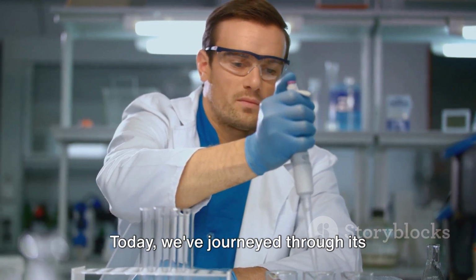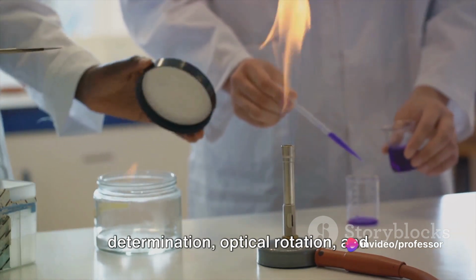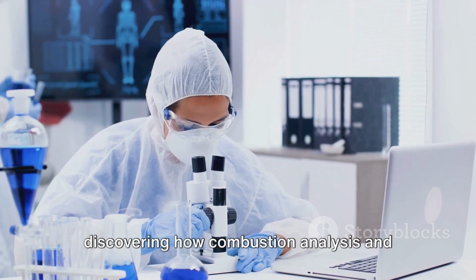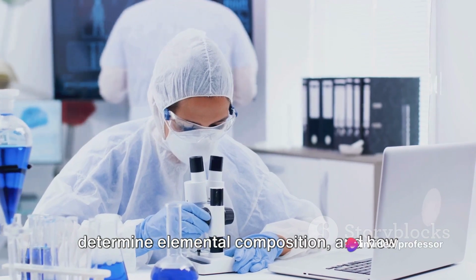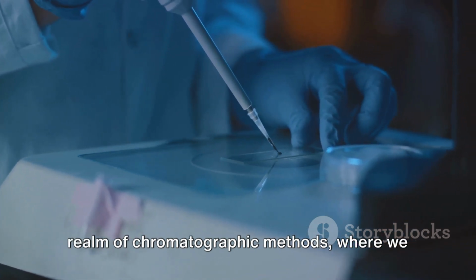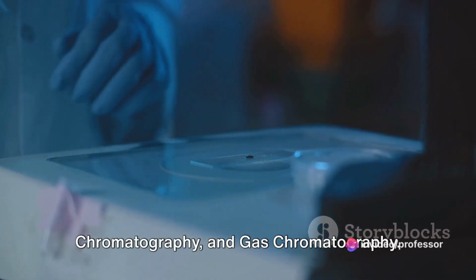Today, we've journeyed through its riveting landscape, exploring physical methods like melting and boiling point determination, optical rotation, and refractive index. We've delved into analytical methods, discovering how combustion analysis and high-resolution spectrometry help determine elemental composition and how relative molecular mass is established. Our expedition took us further into the realm of chromatographic methods, where we learned about thin-layer chromatography, high-performance thin-layer chromatography, high-performance liquid chromatography, and gas chromatography.